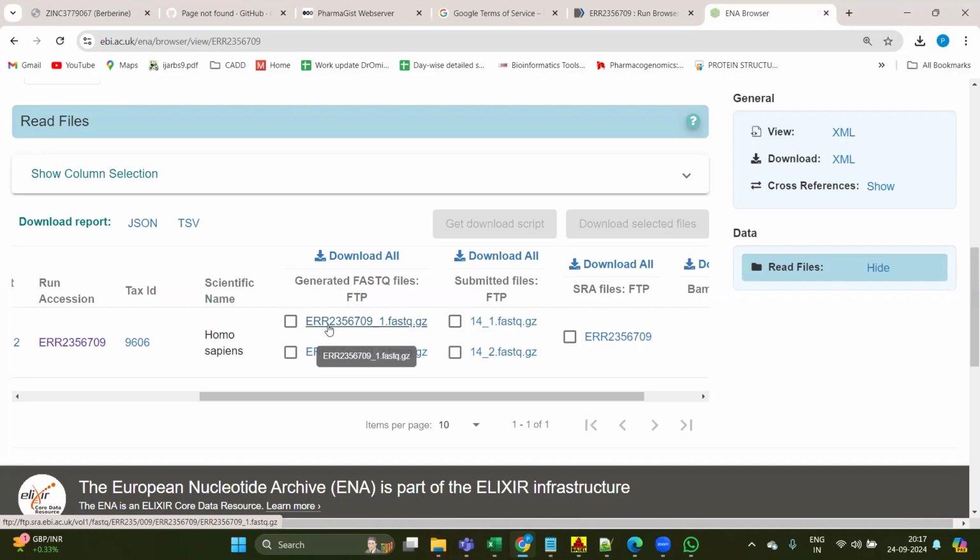So whenever you are downloading larger files, like raw data, reference genomes or GTF files, try to use the WSL. So how can you use the WSL to download the data?